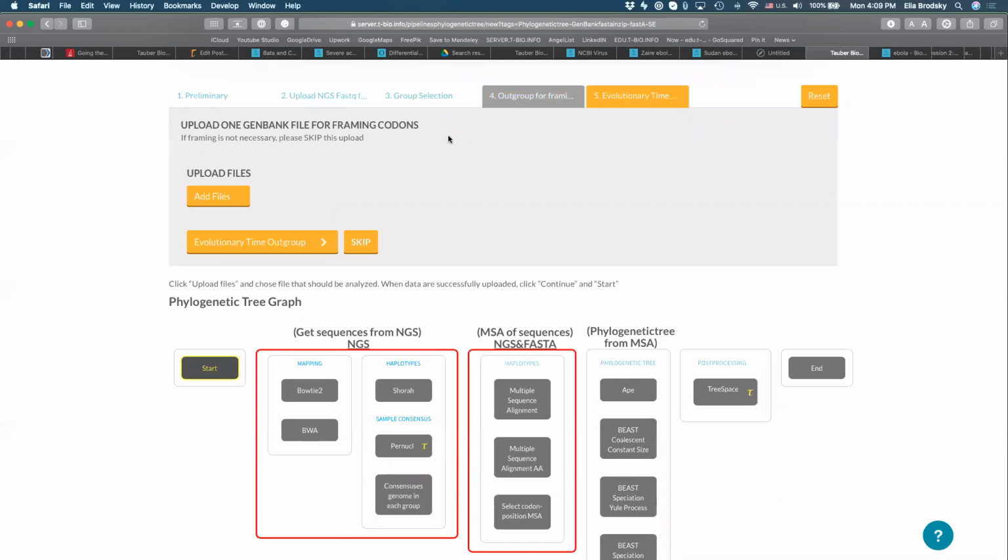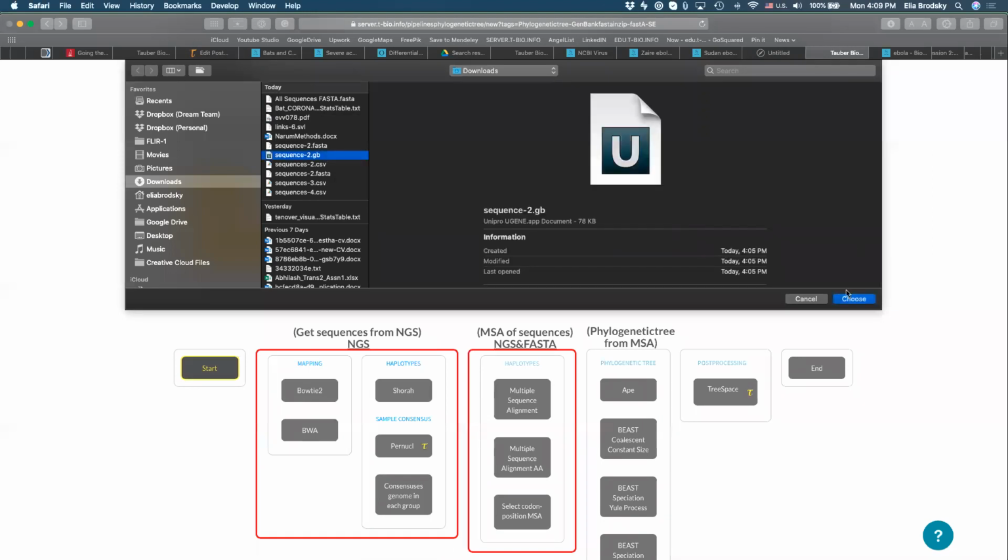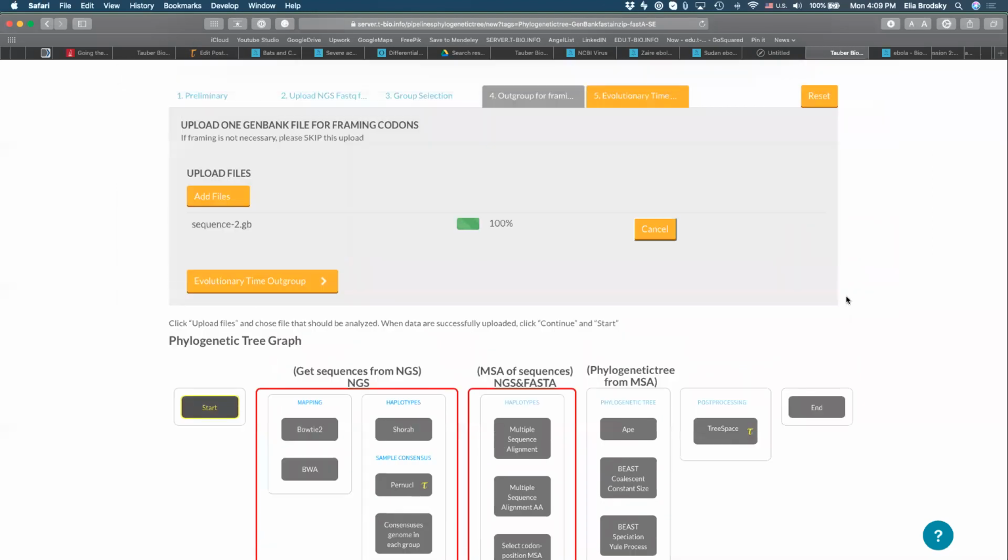As you know, we're not just going to do multiple sequence alignment of the genomic sequences, we're also going to use the conversion to amino acids. And amino acids are encoded in codons. So to do that, we can just use the GenBank file that we just created. And that GenBank file is going to contain the conversion between nucleotide sequence and amino acid sequence organized by different genes.